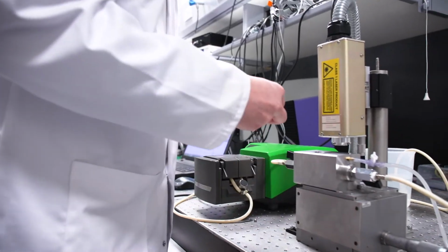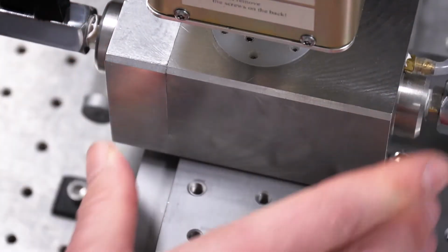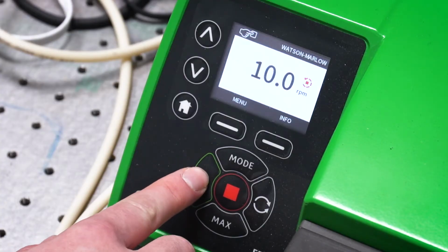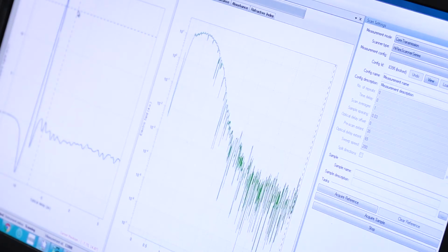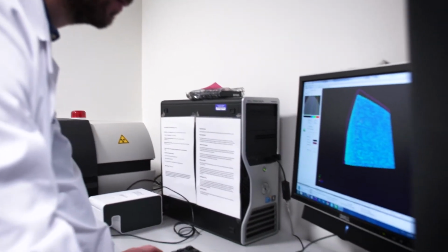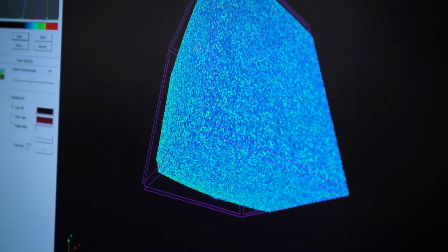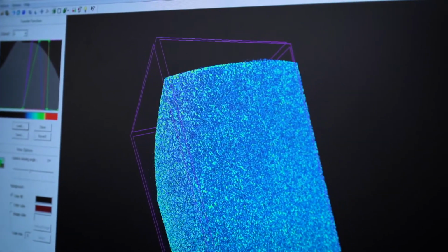We use terahertz technology to measure the porosity. Porosity is important for the pharmaceutical industry as it is directly correlated to the performance of the majority of pharmaceutical tablets. We send a pulse of terahertz radiation through a pharmaceutical tablet and measure the refractive index of this tablet. This refractive index is then directly correlated to the porosity of the tablet. On the other hand, we can use X-ray computed microtomography to measure the pore structure. Here we can analyze the pore shape, size and pore orientation of these pores inside a pharmaceutical tablet.